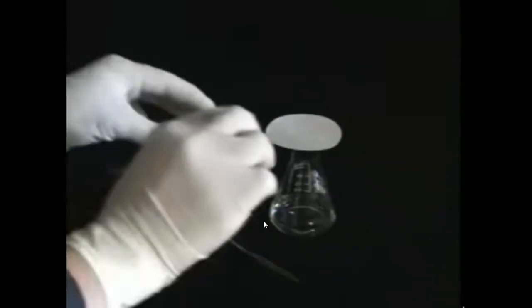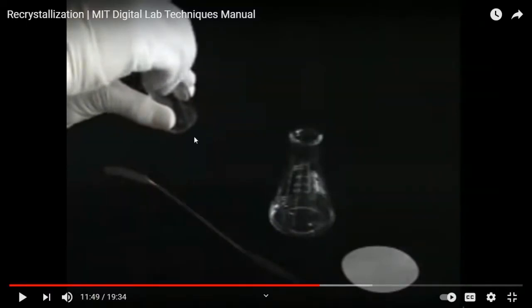Try adding the seed crystal that you set aside at the beginning. Yeah, now here it comes, why you saved it, just in case. The crystal is mainly the main compound, right? So they are already stacking things up naturally the way they would do. The solution is saturated because you cooled down, you have a minimum solvent. So the crystals are there, saturated, almost coming out, but they're not.